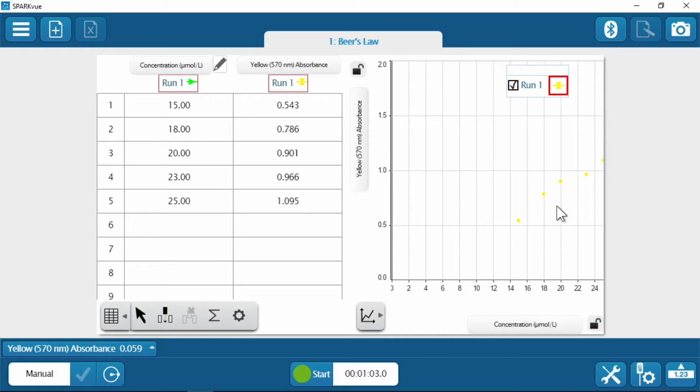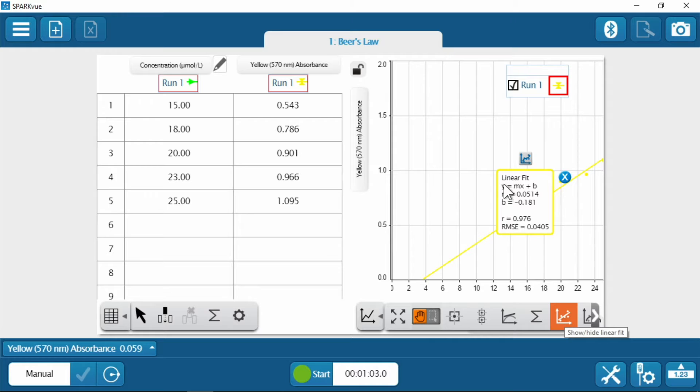We're going to stop this right now. We're going to look at our dots. And we are going to actually use one of the tools to study, to see how linear that curve is.